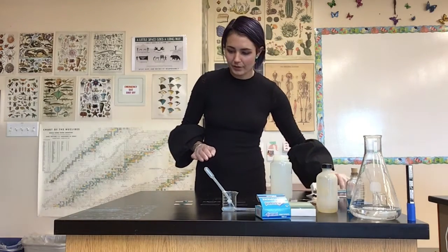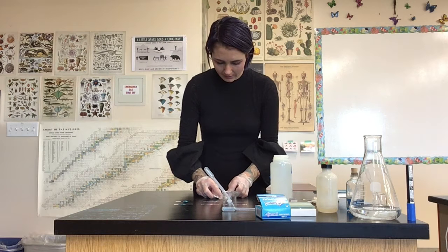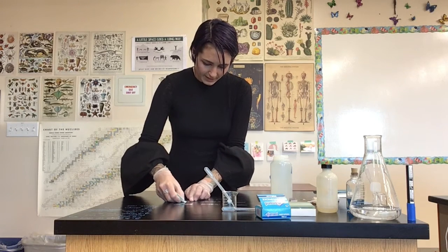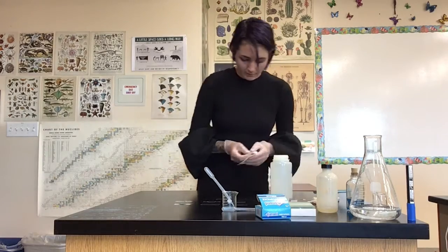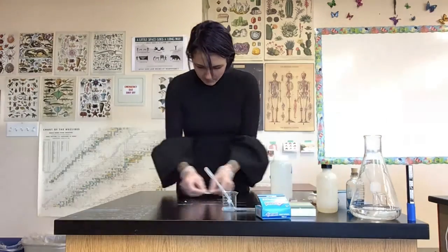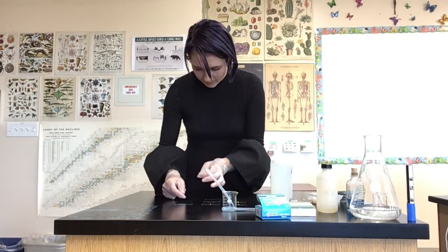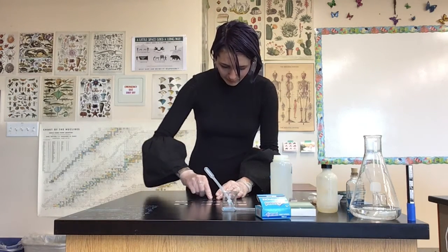I think we are good to soak up all of the excess methylene blue from our garlic cuttings here, little samples. We're going to do the same exact thing that we did with the hydrogen chloride in terms of rinsing it off with some deionized water, and then see what we can find under the microscope. Now I'm going to separate each of the roots to a different slide so I can look at them one at a time. I'm also going to break up the little cutting that I had made of the garlic itself to see if I like those a little bit better.